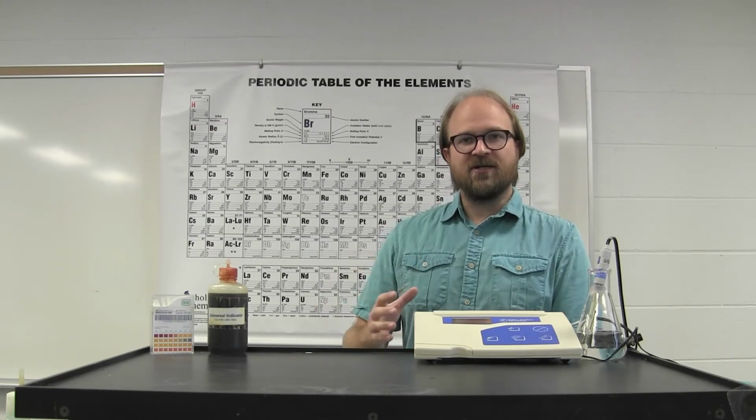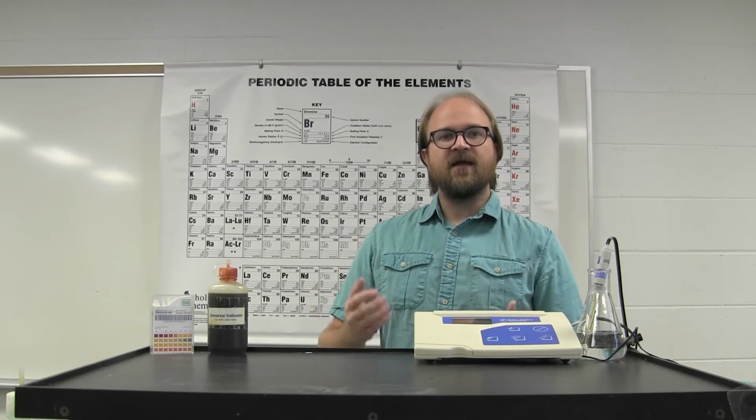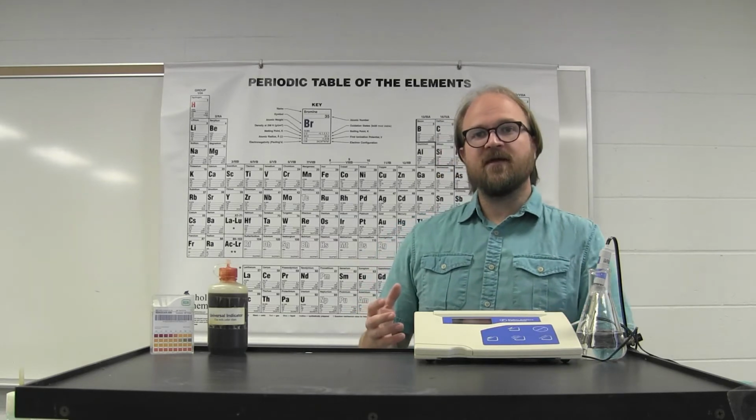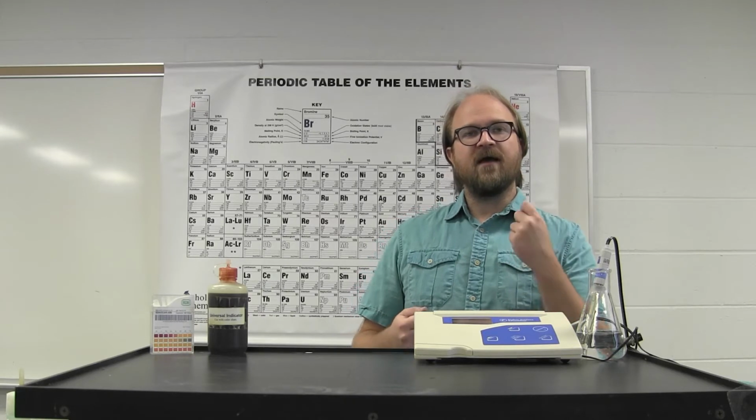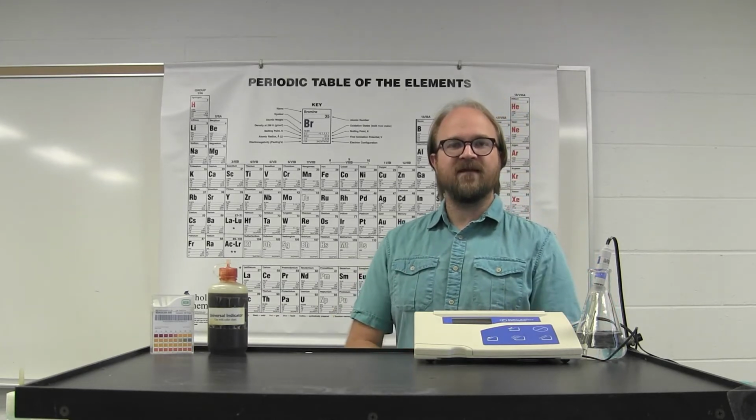That interaction and that equilibrium between acid and base plays a critical role in the formation of buffers. Buffers are a mixture or a blend of an acid and a base that are in equilibrium with each other, where they maintain a relatively constant pH.